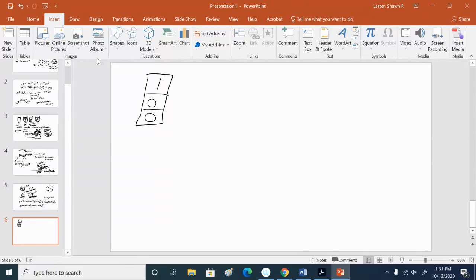So if this were the 0.5 to 10 microliter pipetter, how much would that be? If this was a setting on the 0.5 to 10, yeah, you got to talk to me. How much is that?